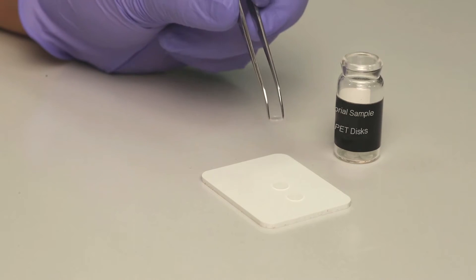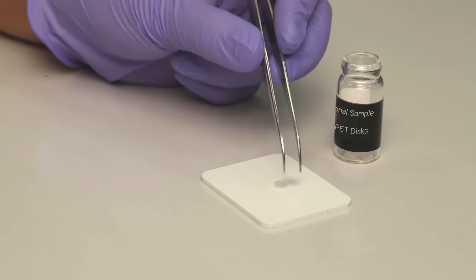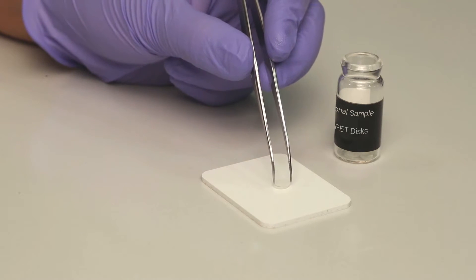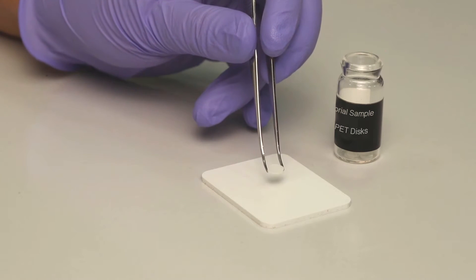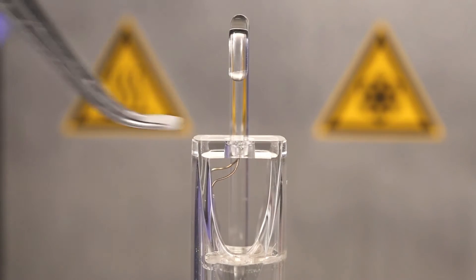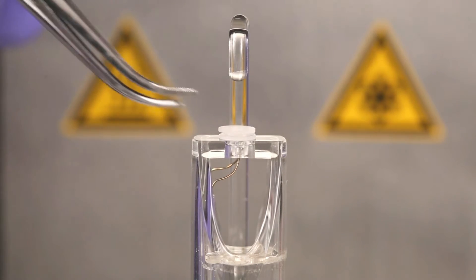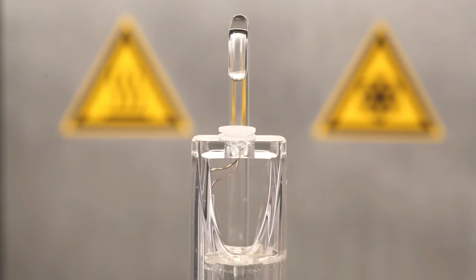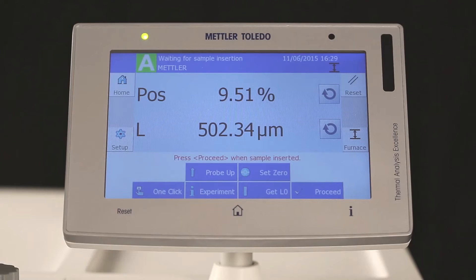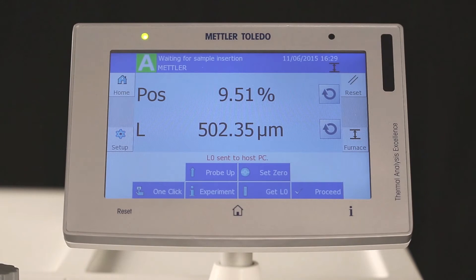Now insert the PET sample between the two fused silica discs and press Get L0. The initial length is sent to STARe software.